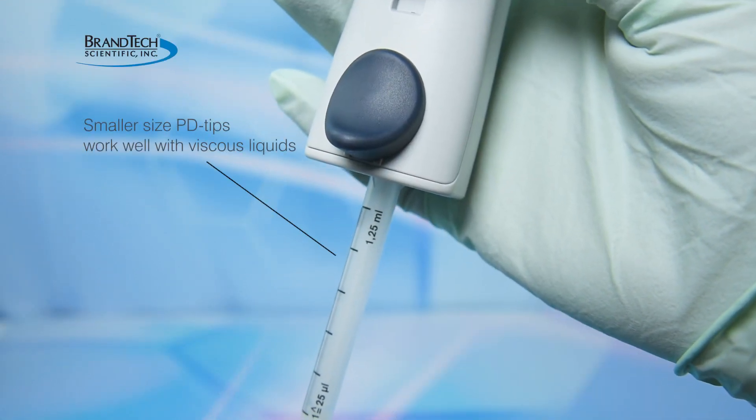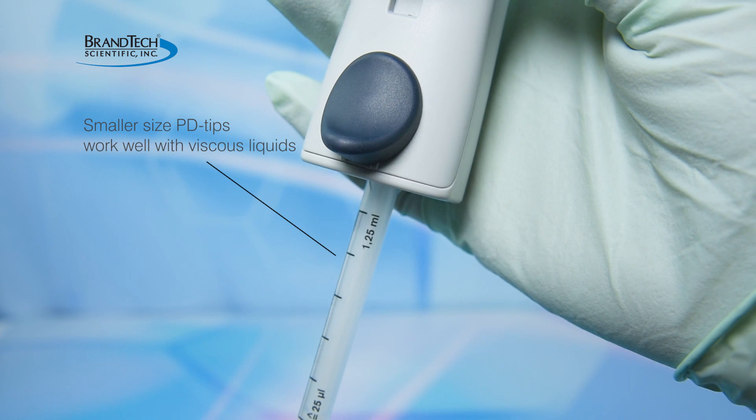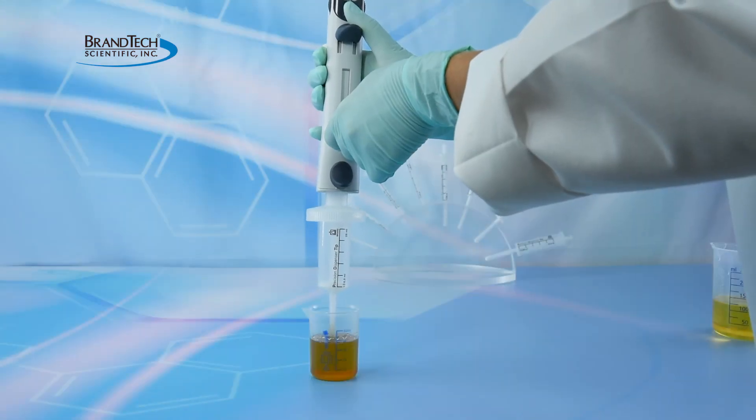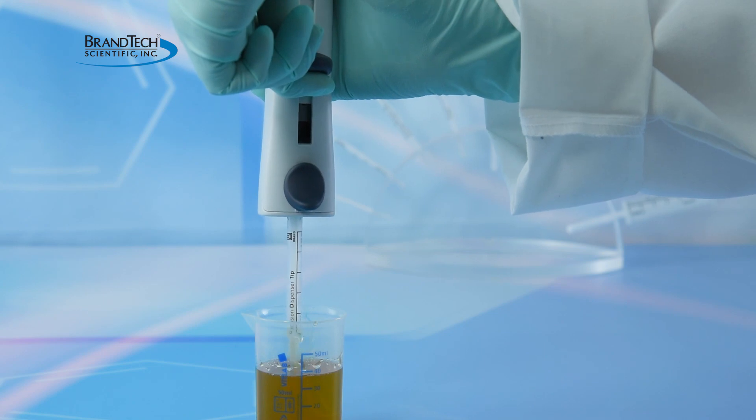You should note that smaller size PD tips can deal with more viscous liquids than the larger ones. If a liquid is too viscous for a larger PD tip, you may want to try a smaller size.